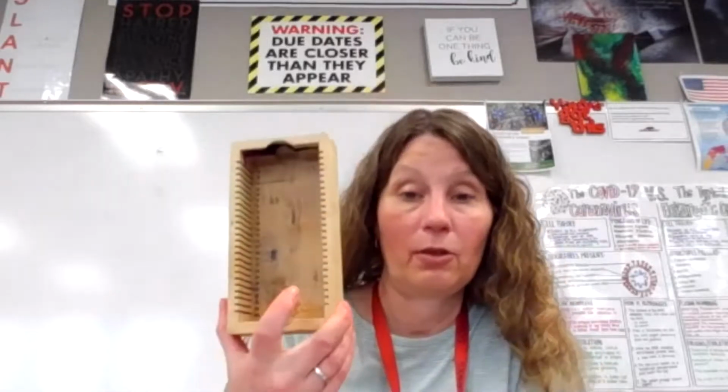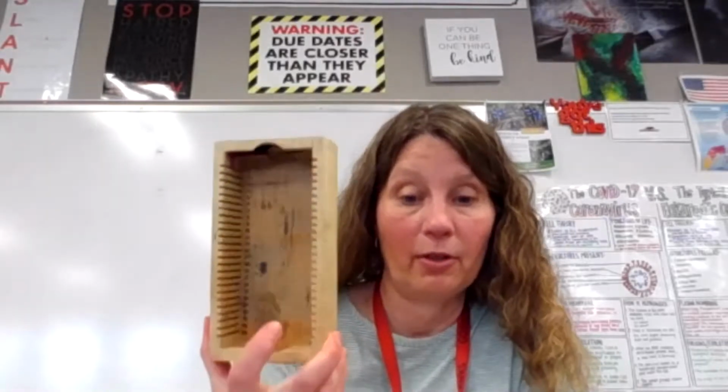You will also actually have to measure with a ruler the diameter of low power on the microscope. So that involves putting a ruler directly on the stage and then looking through the objective and counting the number of millimeters there. That's also an area that can become a little bit tricky to do. And make sure that you estimate if you don't have an exact number of millimeters so you have as much accuracy as possible. When you're finished with your slide, then you'll get one of these labels, put both your names on it and your period number, and then you'll turn it into this slide box that's up here so that I can see your slide that you've created.